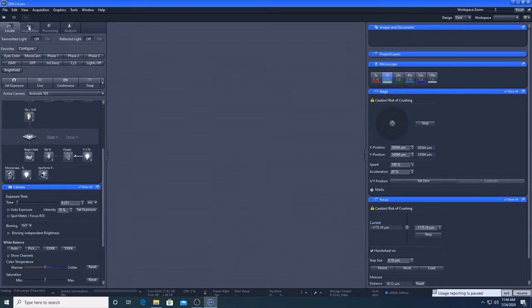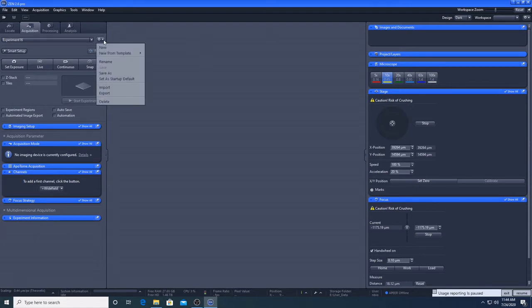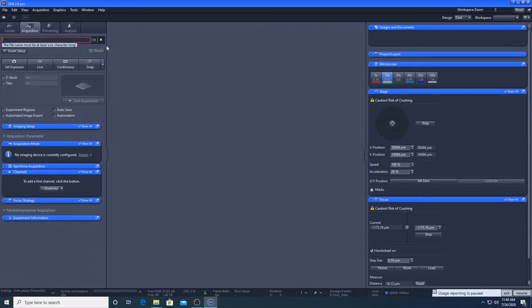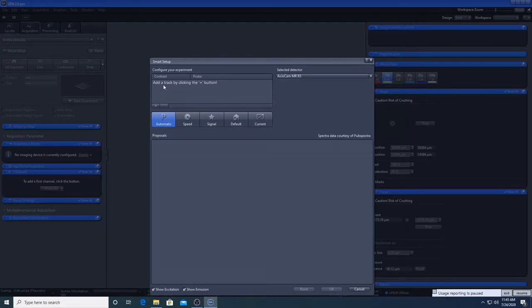Now we will move on to the Acquisition tab where you will likely spend most of your time. We recommend that you create your own experiment where you can save all of your settings. Click here, go to new and give your experiment a unique name. To create your own channels, go to smart setup.